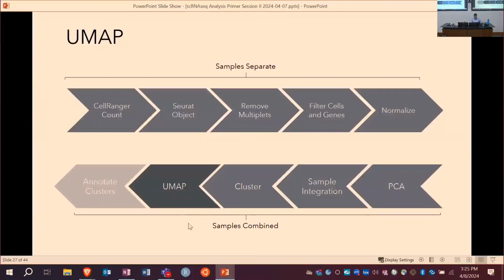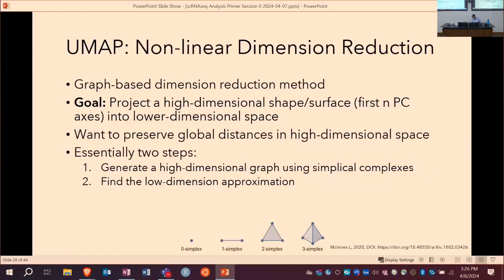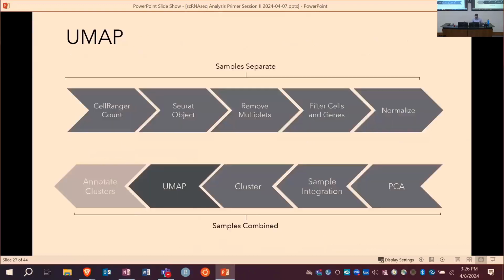All right, so we have two sections left here. I see we have 35 minutes, and I do want to leave time for the survey at the end. I believe it's for the full, what is this, section 3 or whatever it is of the workshop. So I think we should be able to finish by then. I might move along a little bit faster here for these last sections.